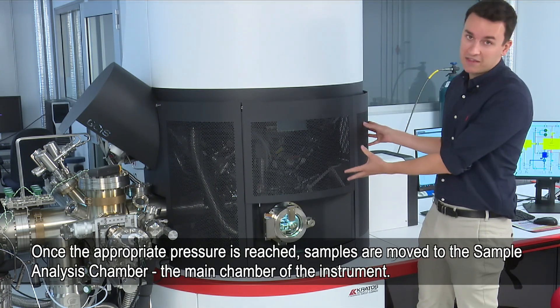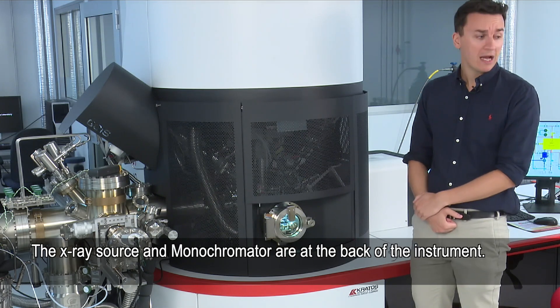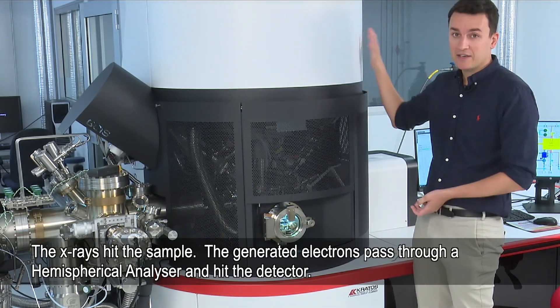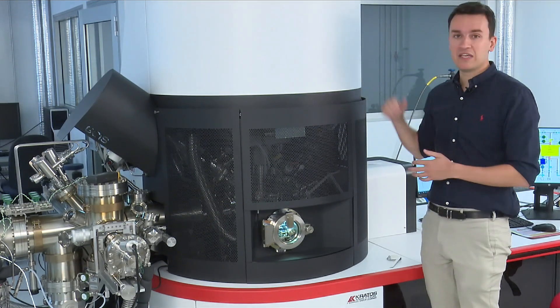That's all within this casing here. The X-ray source is at the back. We also have a monochromator at the back, and then the X-rays hit the sample. The electrons that are generated pass through a hemispherical analyser and hit the detector, and this is all at the top and at the back of the instrument.